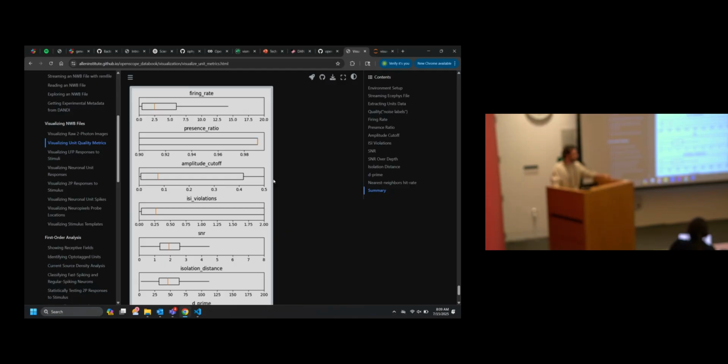Well, the Allen Institute, we already do this kind of implicitly. I've seen, specifically when looking at receptive fields, this is actually really important. Specifically the noise metric, but a number of others like ISI violations have shown to be pretty useful in getting good receptive fields, or units that have good receptive fields, that is.